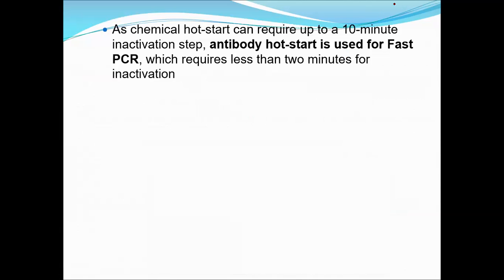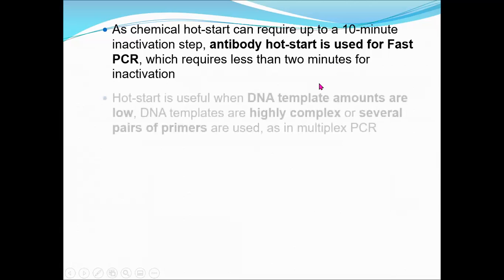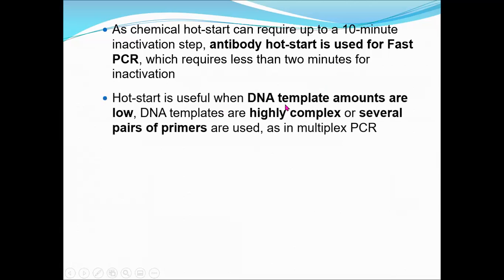The chemical hot start can require up to a 10-minute activation step. But for antibody-mediated denaturation, you need just 2 minutes of activation.